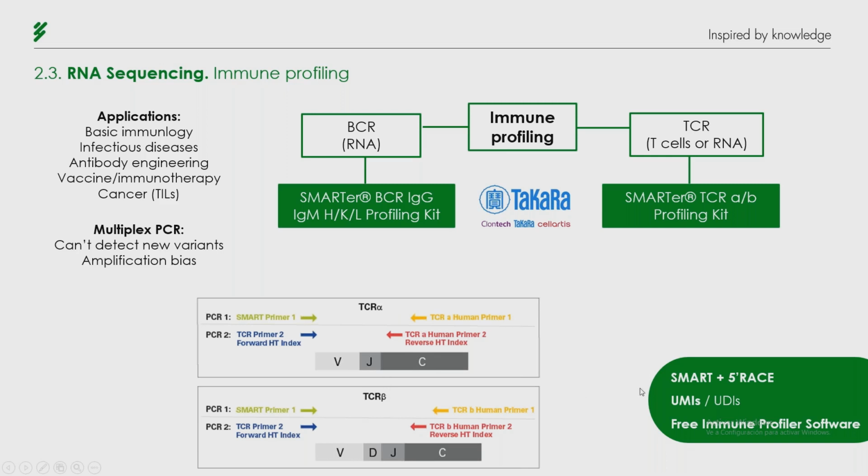It's also worth mentioning that with these TCR kits, you can decide to either sequence all the variable region, which you can do on MiSeq platforms, for example, or instead you can focus on sequencing only the CDR3 region, and this we can do on any Illumina platform. Just so you know, the TCR kit by Takara, they also offer a specific version for mouse cells and another specific solution for humans, one at the single cell level and one for both populations.